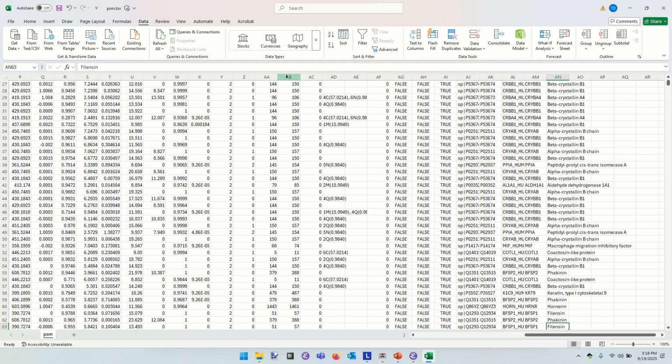I know one person who has attempted to use open searching for cross-linked peptides. Yeah. That is a hard case. So then your modification is essentially an entire extra peptide. That's correct. You can abuse the feature, and it may work well for you. But ultimately, we would like to think that cross-link identification software is better at interpreting such spectra.